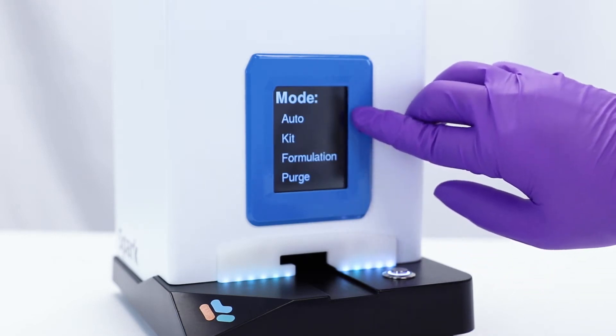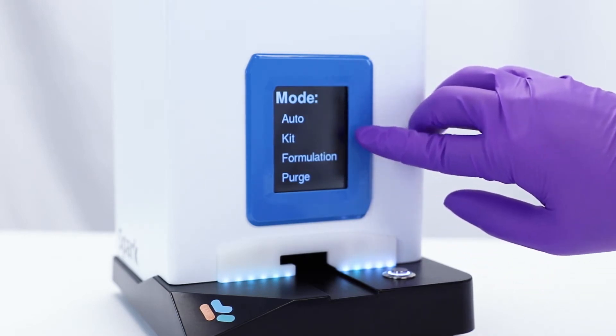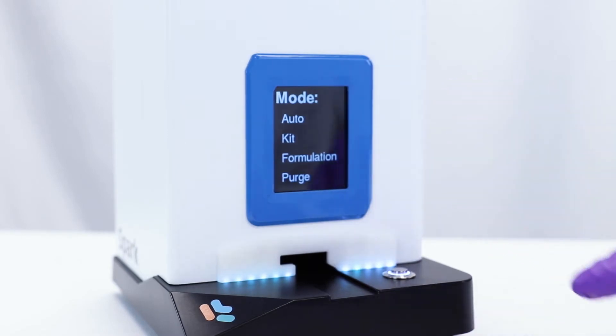The first mode is Auto. In this mode, the Spark reads a cartridge and enters Kit Mode or Formulation Mode automatically based on the cartridge programming.